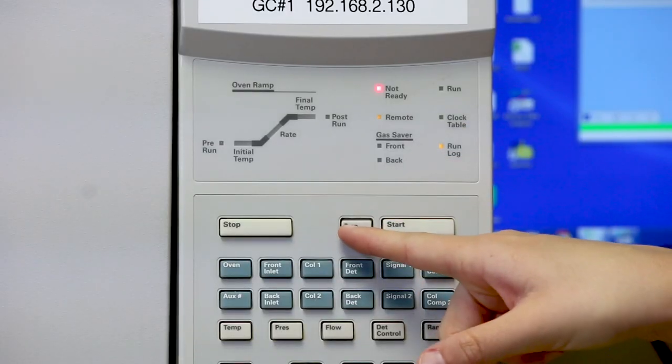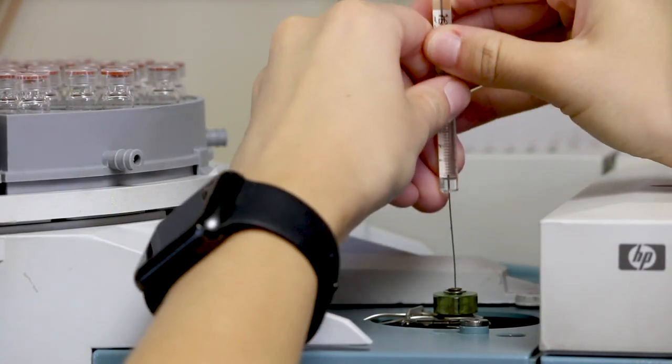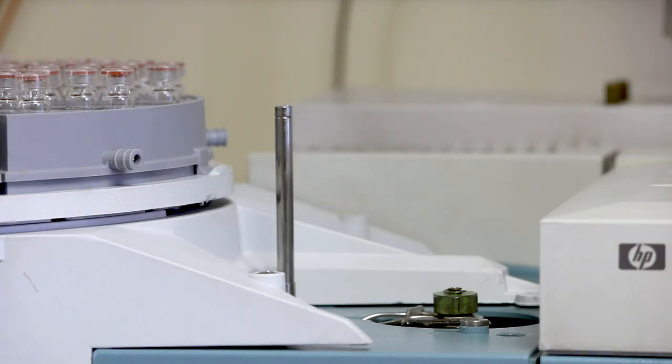Now we prep the machine. Then we shoot one microliter into the injection port. We're ready to go!